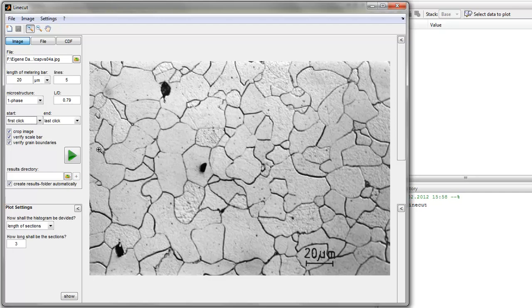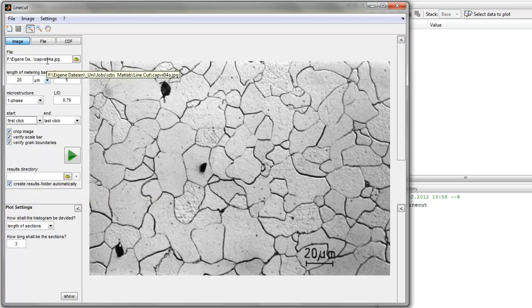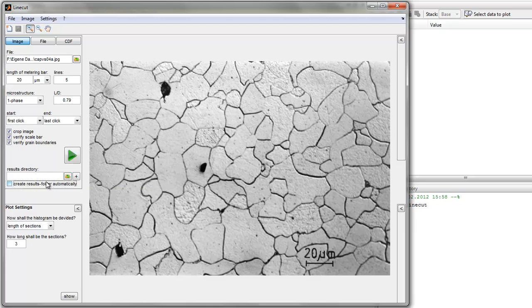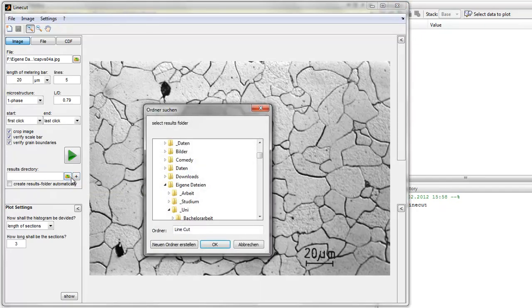Before we can start you have to choose a results directory where the chord length file will be saved. You can let it be created automatically. That means the program will create a new folder within the path of your picture — a folder called 'results' and inside it a folder with the current date when you press start. You can also do this manually by clicking the plus button or by browsing your computer.